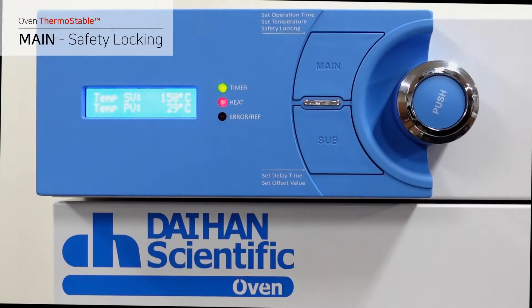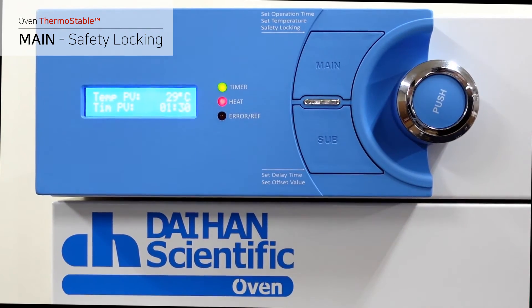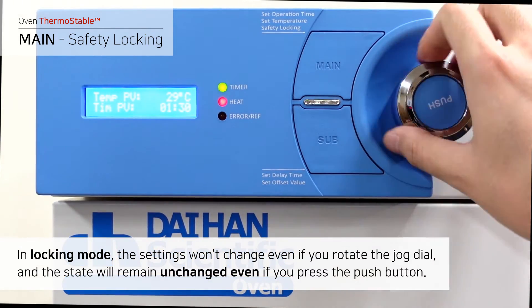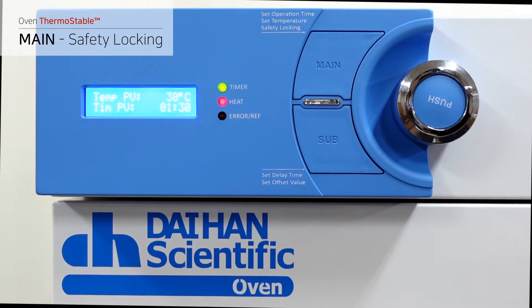Press the main button on the temperature setting screen and it will enter the locking mode, where you can see the current temperature and the remaining time. In locking mode, the settings won't change even if you rotate the jog dial, and the state will remain unchanged even if you press the push button. You are advised to maintain locking mode when operating the product once you have set the temperature and time.